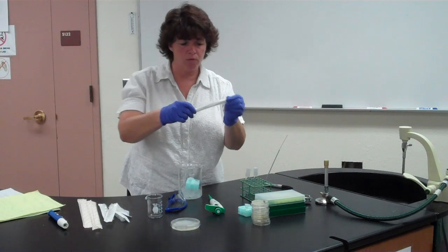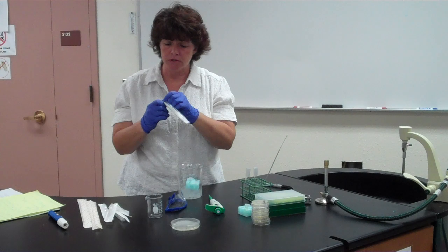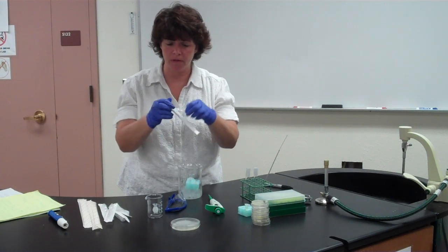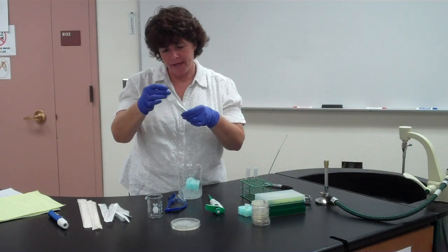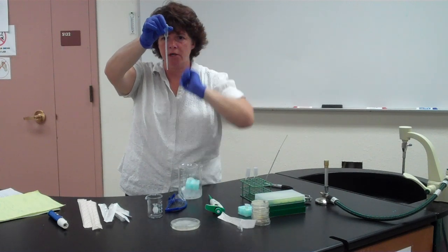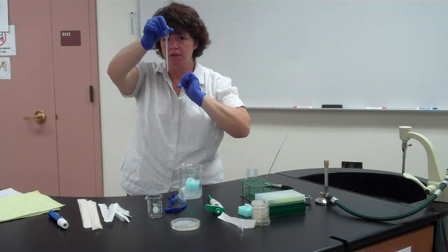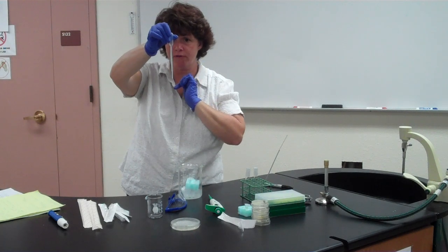For this particular one, you're going to use one of these transfer pipettes, but these are sterile. So make sure you open it from the bulb end rather than the tip, okay? And on these particular pipettes, it's a 1 ml pipette. So the very top mark is 1 ml, the middle mark is 0.5, between the 0.5 and the bottom is 0.25, which is 250 microliters.